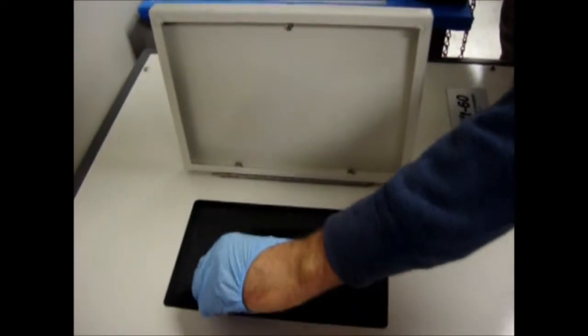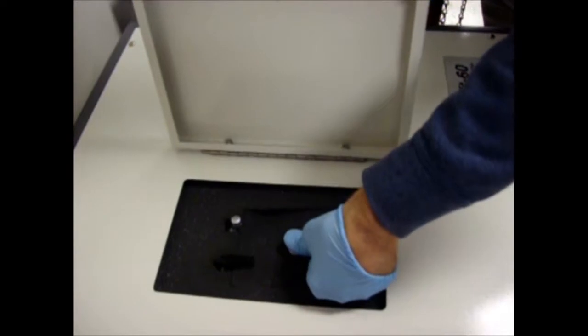Now, if you could please pass me that light apparatus. Now, the whole point of checking this with the light is to see if it's spinning, which we can clearly see that it isn't. So we're gonna see what the trick is. Put a glove on and you cover it. Here, go ahead and you can put it down again. That's fine. See if that fixes it. Yeah, it is spinning now. So we're all good to go.